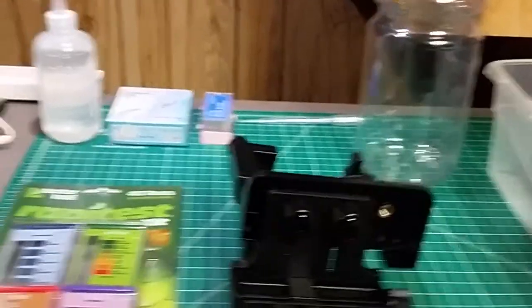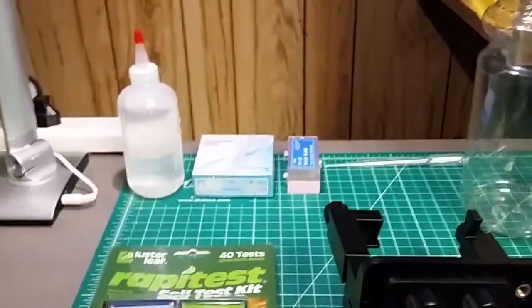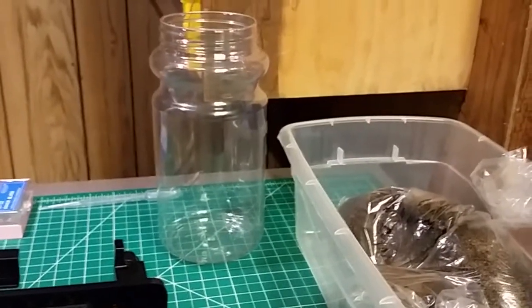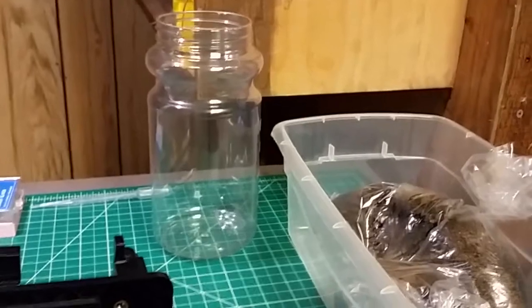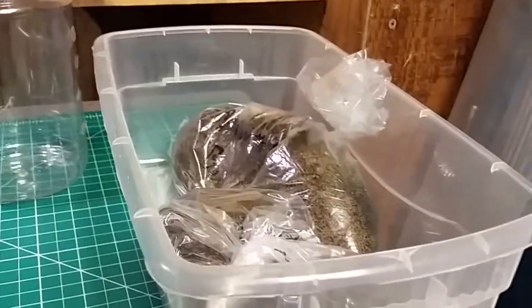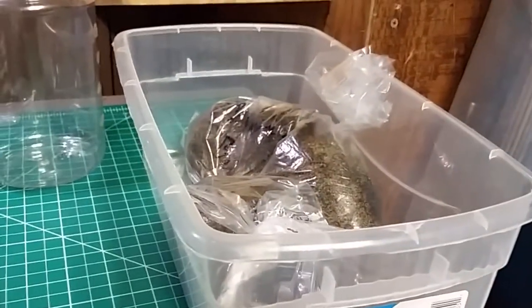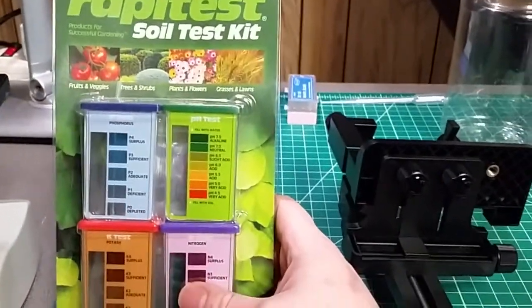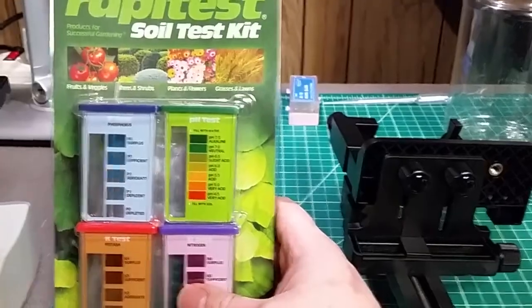I've got my usual bits: some water, spare slides and slide covers, droppers as needed, a clean container to hydrate our soil and decant just a sample of the water that results, and our sample bin. We're going to start with the commercial do-it-yourself NPK and pH test.